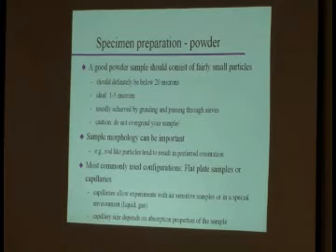How do you achieve that? Well, one thing is you grind. Okay? Another thing that can help you is there are so-called sieves. These are basically meshes of different size holes that you can stack, and then you throw your sample in at the top. You kind of shake it, or you might even try to grind on the sieve, and only the things that go through are below a certain size, below the mesh size of your sieve. Okay? So that's a way of actually figuring out what your particle size is, and to sieve out all the particles that are too big that you don't want to use.